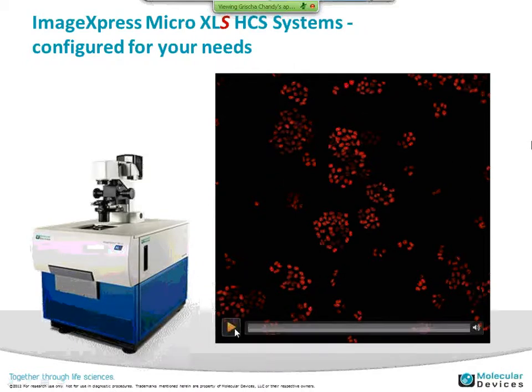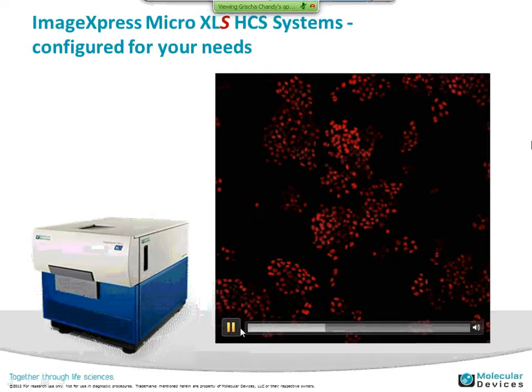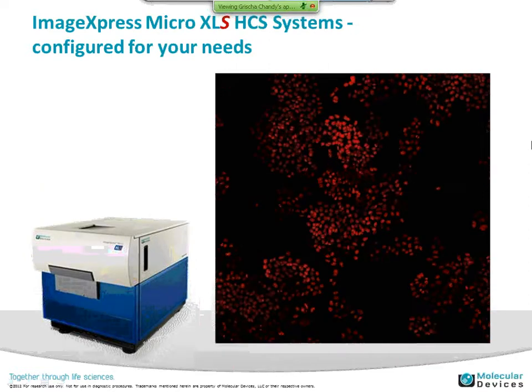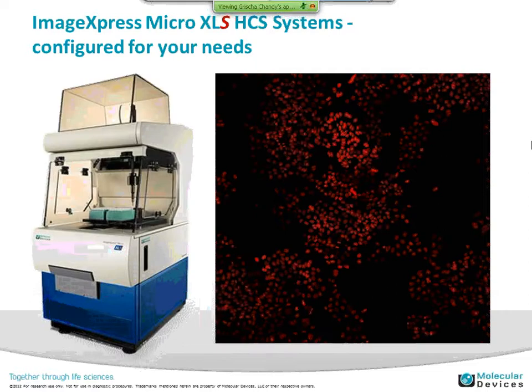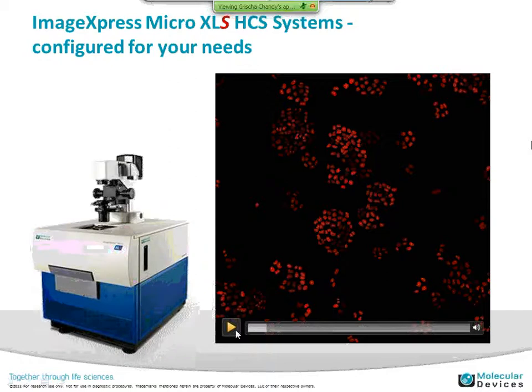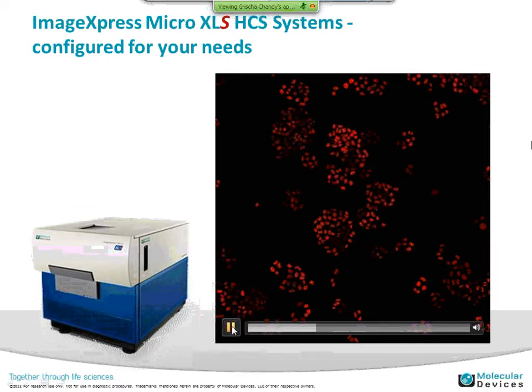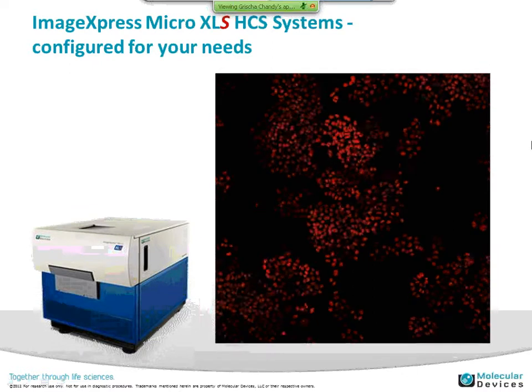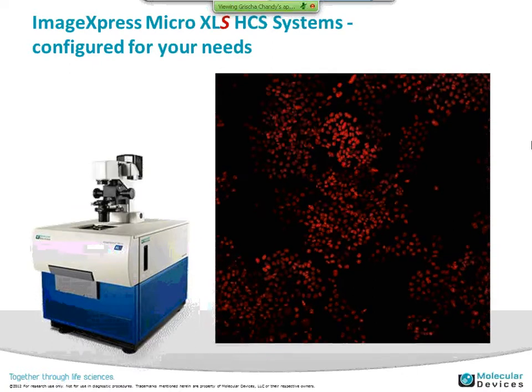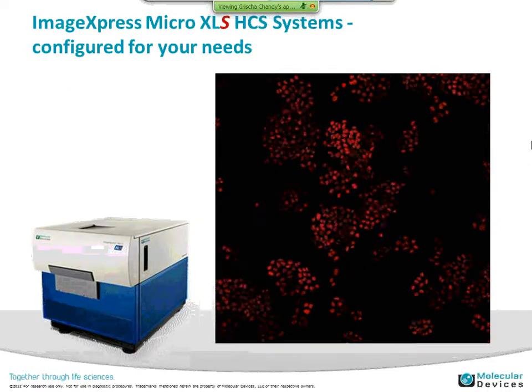And here is a multi-day experiment where the cells are quite happy, so happy that they divide. And this movie was not taken sitting in a single well, but going from well to well to well. And there's more movement of the cells than the system going on, so you can follow live cell events.